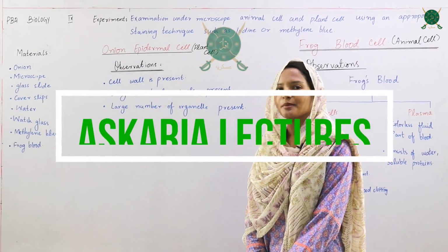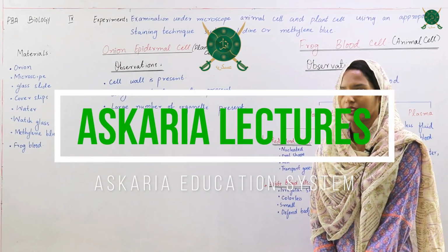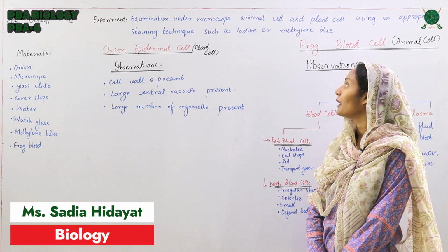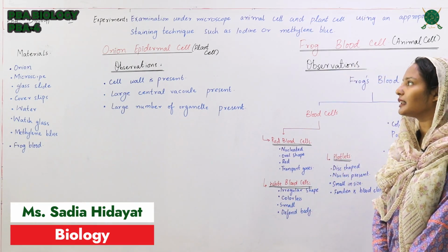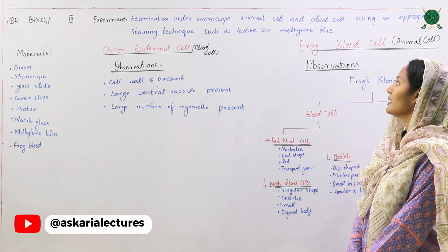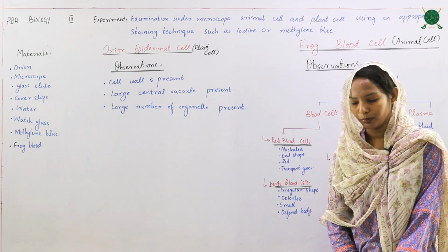Assalamu alaikum. I am Sadia and today we are going to conduct an experiment, that is examination under a microscope of an animal cell and a plant cell using an appropriate staining technique such as iodine or methylene blue.